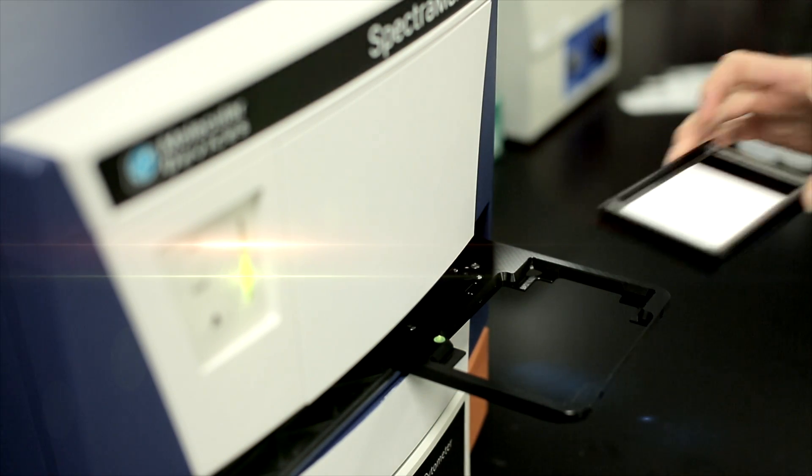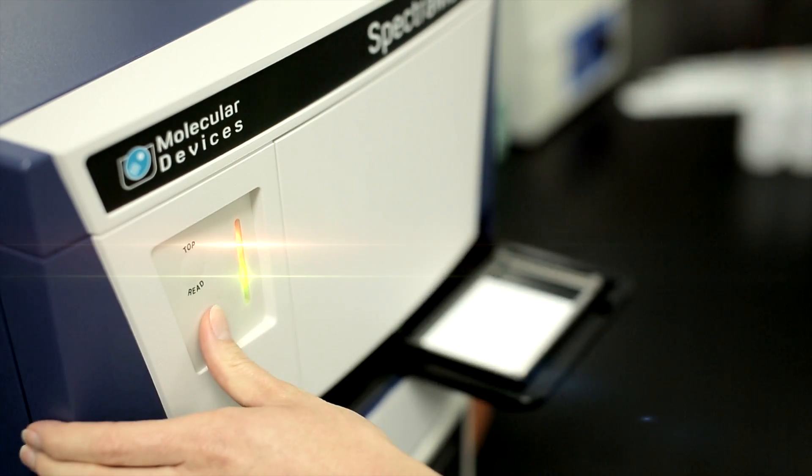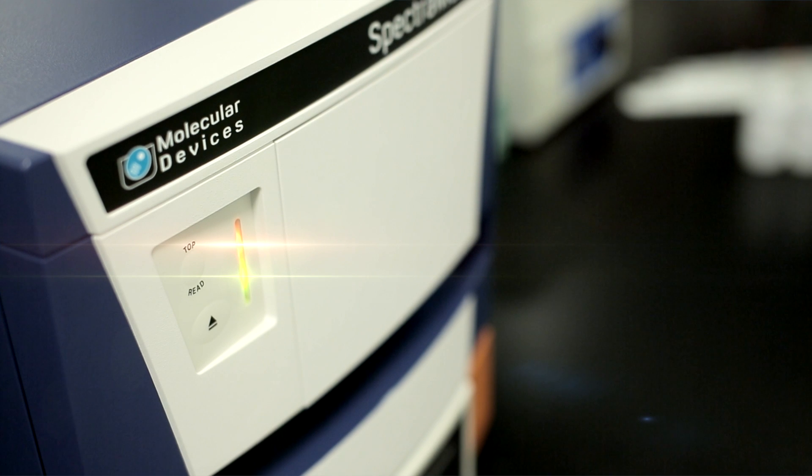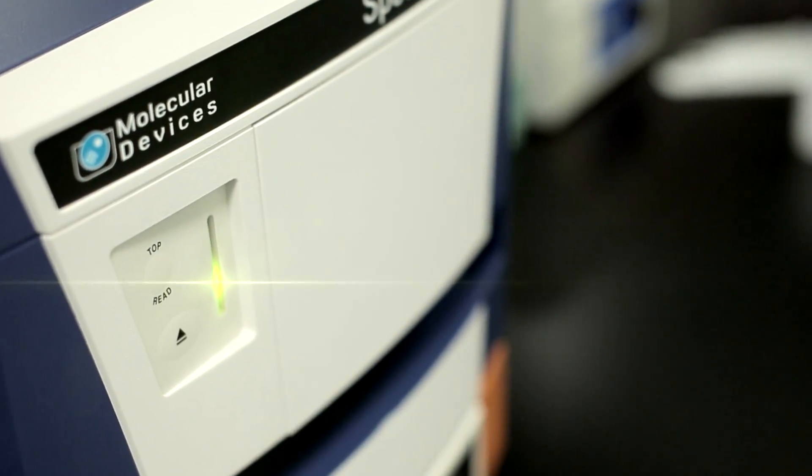This substrate-free Western blot system provides a convenient measurement window. Scan your membranes immediately after the final wash step or at a later time when it is convenient for you. Signal stability is longer than 30 days, so take your time.